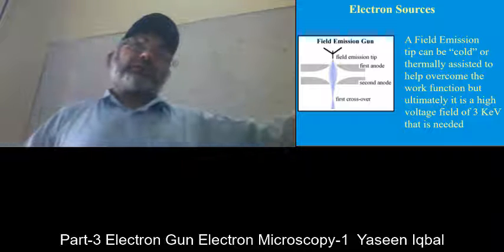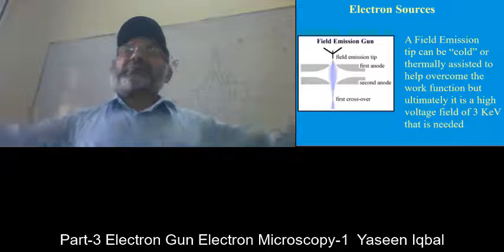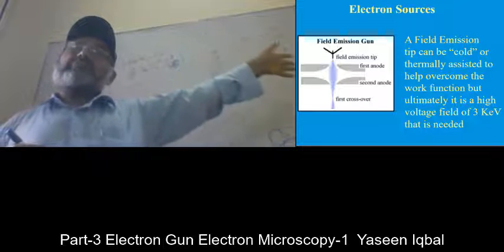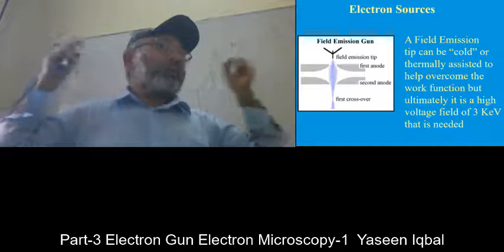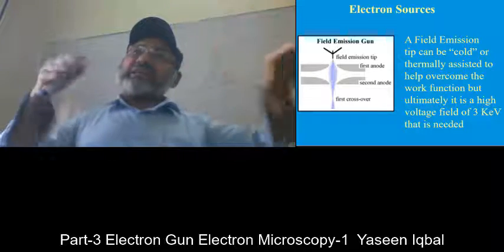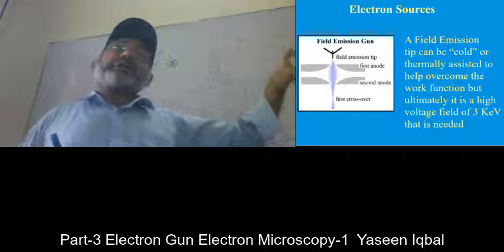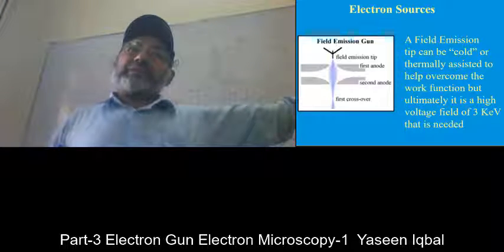The pouring water will be scattered, right? For example, the rain is coming and you are collecting water and taking somewhere. So in the case of thermo-ionic emitter, the electrons are not under control. Wherever the heat reaches, the electrons are emitted from different parts of the filament. But in the thermo field emission, the field brings electron into a stable position.